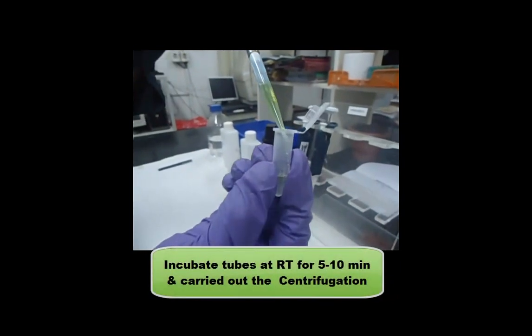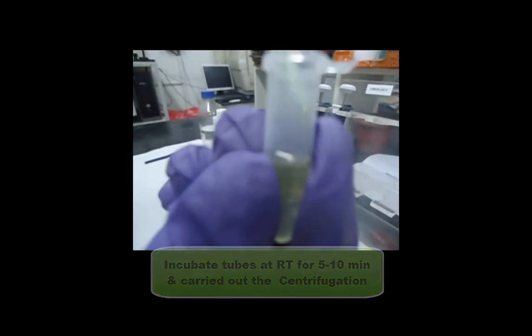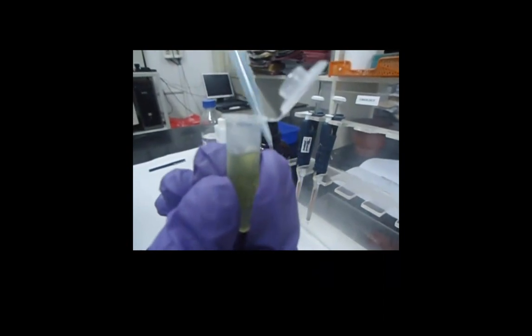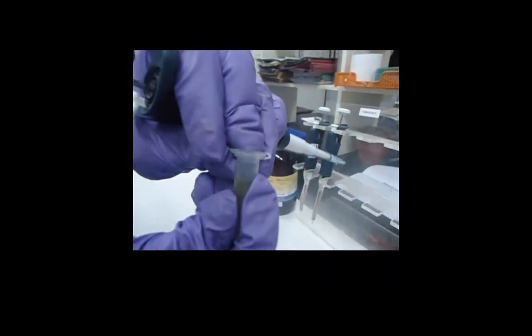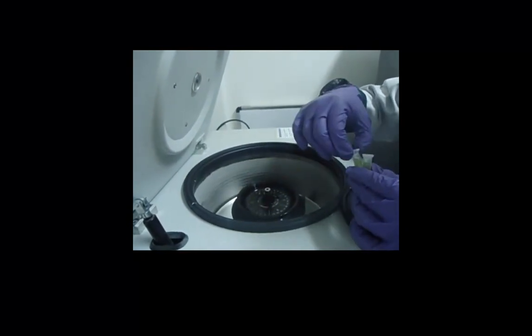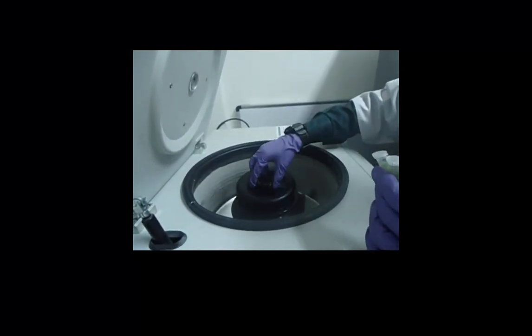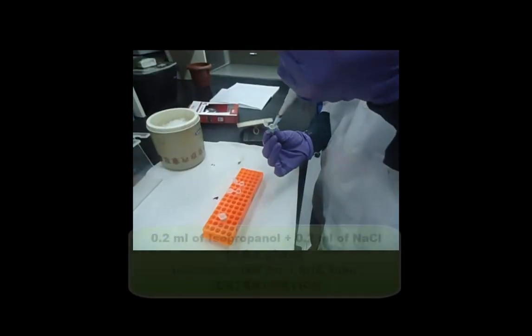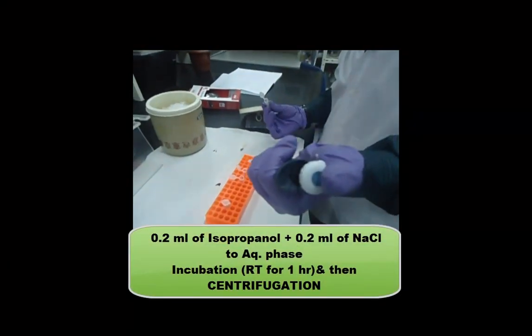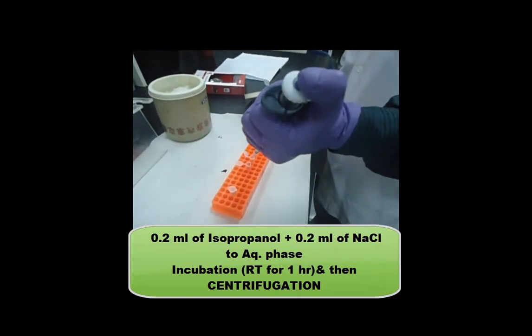Then incubate the tube at room temperature for 5 to 10 minutes and centrifuge at 10,000 rpm at 4 degrees Celsius.